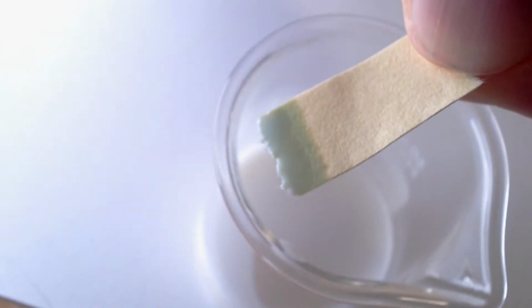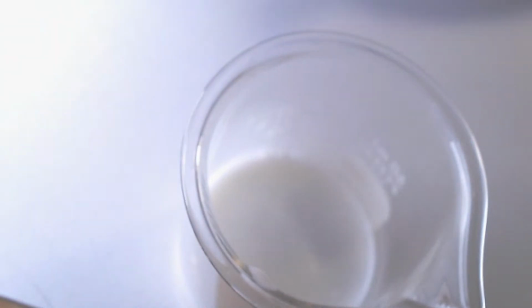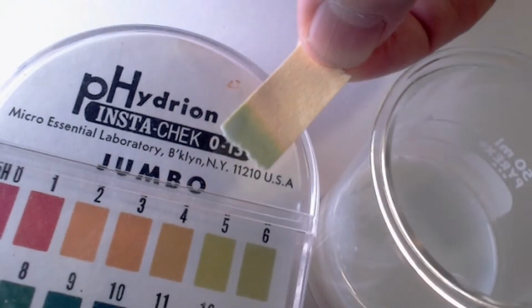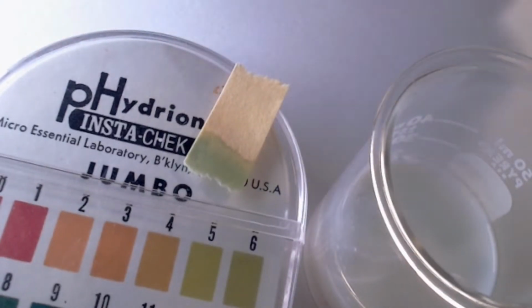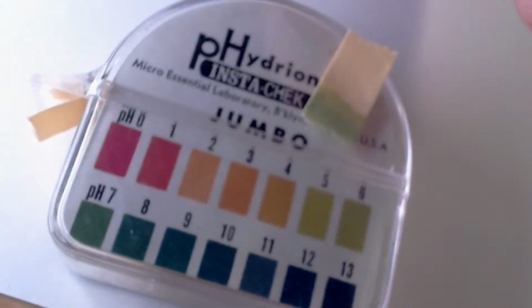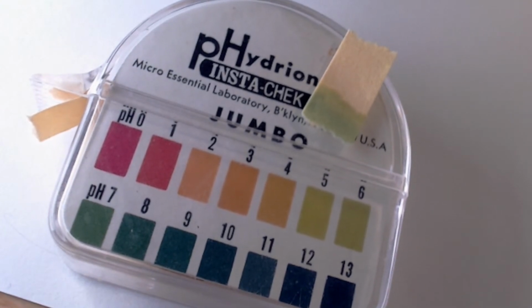Milk is kind of interesting. It's like green. So if you look at the pH paper here, let's move our milk out of the way. It's kind of like 5 or 6, maybe even higher than 6, but it's not 7. Milk's definitely not 7. And what they say, milk should be a pH of about 6.5. So I'd agree our pH paper is working pretty well.